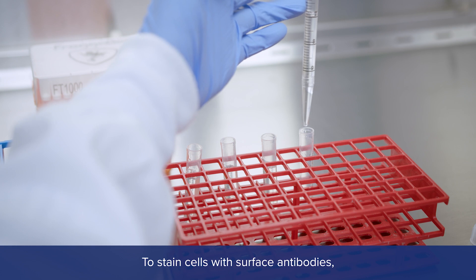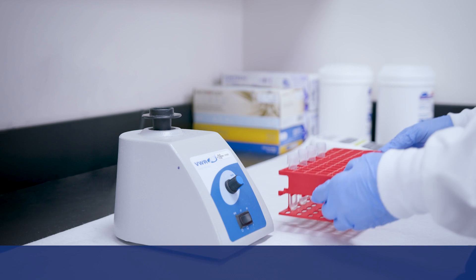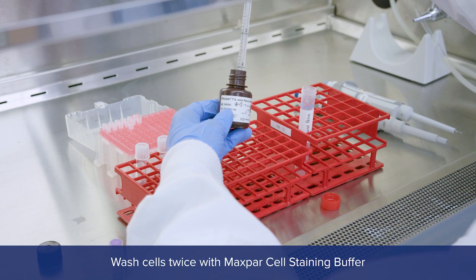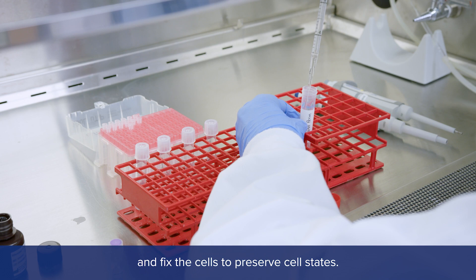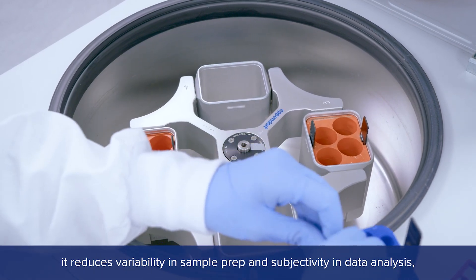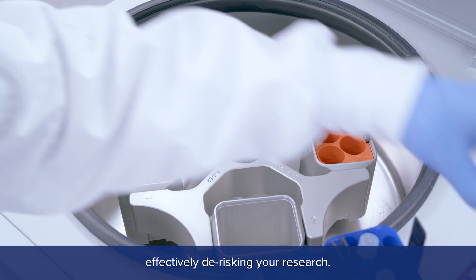To stain cells with surface antibodies, just add your sample to the single tube, mix, and incubate for 30 minutes. Wash cells twice with Maxpar Cell Staining Buffer, and fix the cells to preserve cell states. Because the assay is validated, it reduces variability in sample prep and subjectivity in data analysis, effectively de-risking your research.